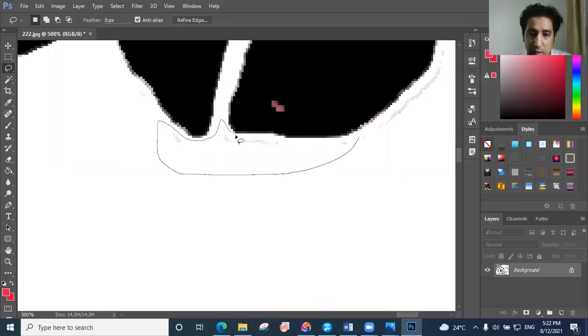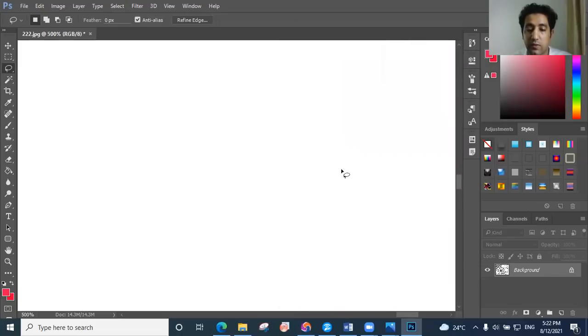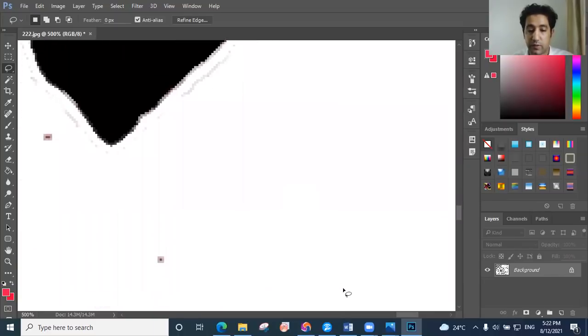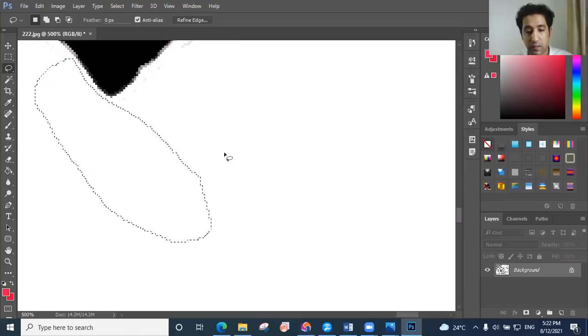All right, here, delete, then okay. And then go down, down, down. Here you find this, and you must be clean here. You go down, this, clean.